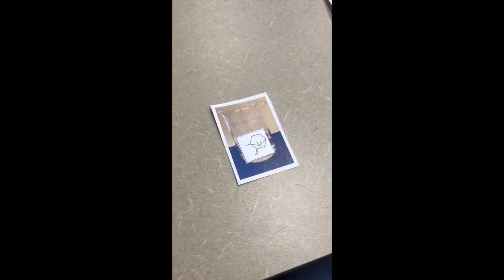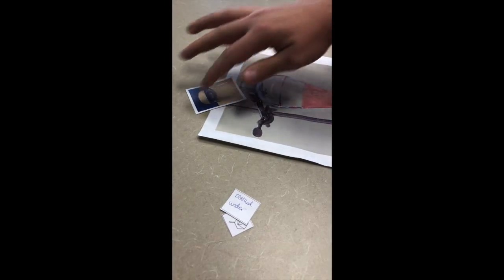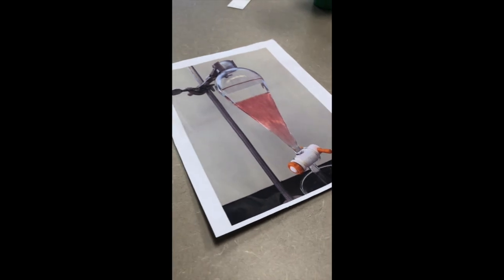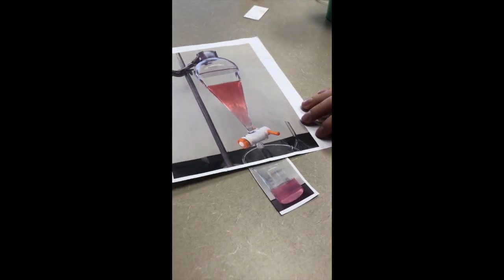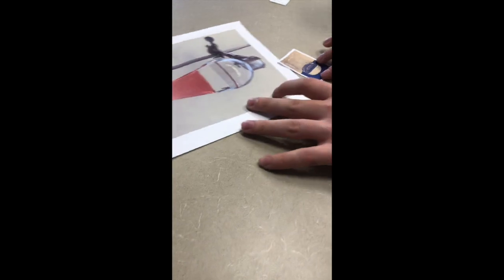Now we move on to the camphor, which is in our organic layer. We will mix some distilled water into our organic layer and swirl the mixture. Then we're going to pour it back into that separatory funnel, and there's going to be some layers forming. So now we are going to take out that bottom layer, as it is that water wash that we don't need. And then we're going to take out our organic layer from the top.